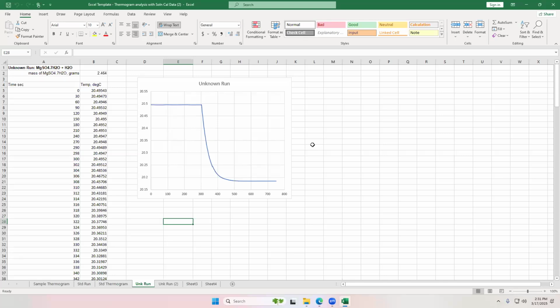So today our focus was to determine T initial, T final, and T mean from the thermograms for solution calorimetry and bomb calorimetry. And then after we've done this, we're going to go to the lab. I'll show you the equipment that we have and what you need to do. You need to prepare for your experiment next week. Okay?